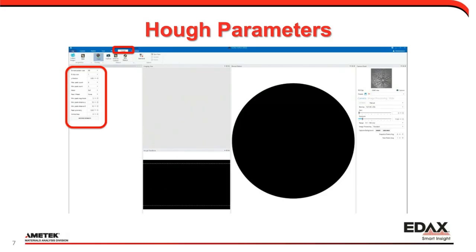These Hough parameters are going to be things like theta step and min-max distances. These are the lesser used ones. I'm going to talk about things like vertical bias, max bands, and the effects that these have on your data because, again, most of these Hough Transform parameters aren't used all that much. But the ones you use can have big differences on your data.